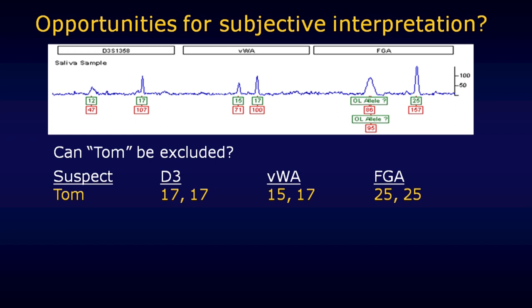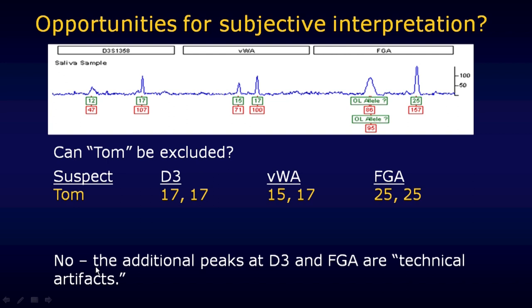What are we left with? For this evidence sample we see the 25 at the FGA locus, an artifact (blob) we can discount, a 15-17 at VWA — a good match to suspect Tom — and a 17 at D3 that he could have been the source of, plus a 12 that might be just technical noise. So at the end of the day, can Tom be excluded as a possible contributor? The answer is no — his alleles are showing up on the electropherogram, and the things that aren't his alleles can be dismissed as technical artifacts.